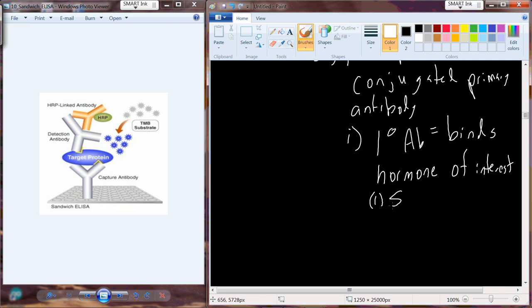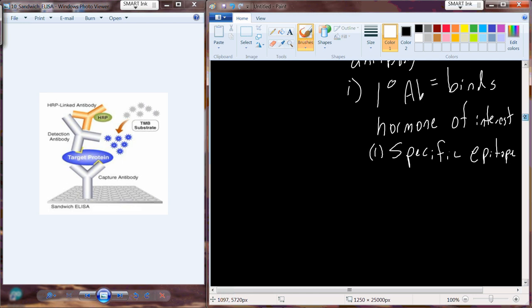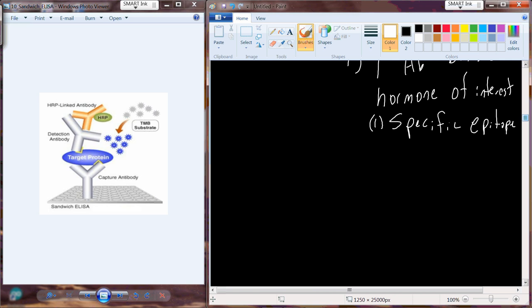What they bind to is known as an epitope. This is a part of the molecule, a sequence of amino acids or a sequence of molecules in a lipid that the antibody will bind to. So they bind to a specific epitope. And that epitope is going to be specific to your molecule of interest. And that's kind of how you get the specificity here, is you're dialing into a very specific region on that molecule. So the result here, when you expose that hormone extract to those primary antibodies, is that the primary antibody captures the hormone.